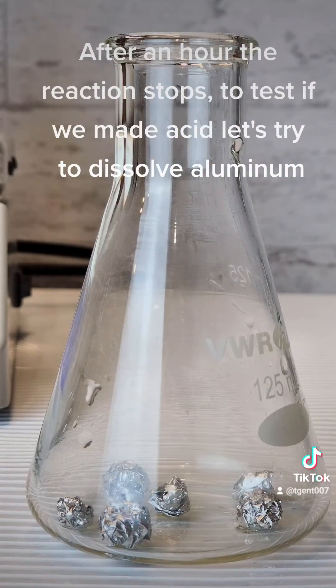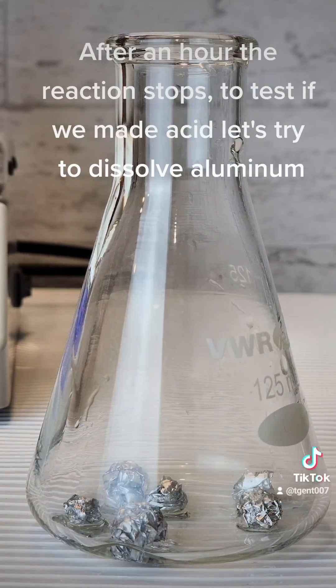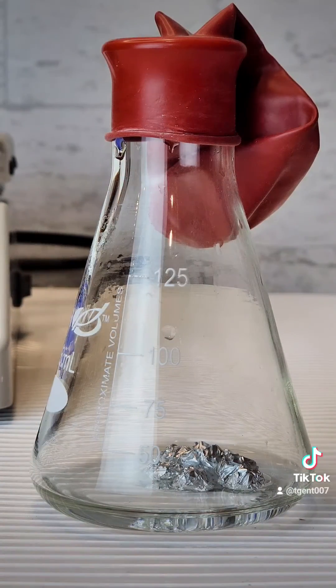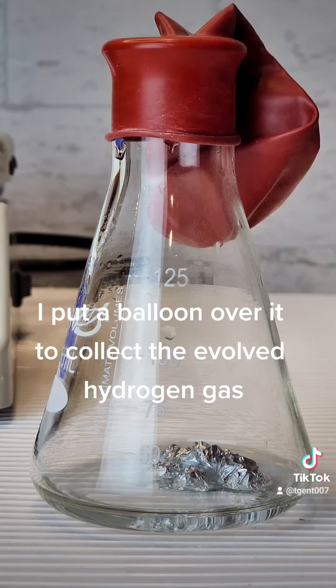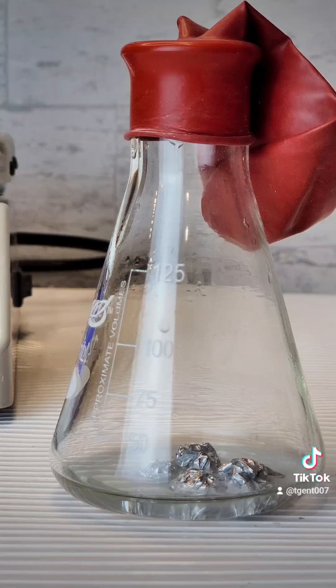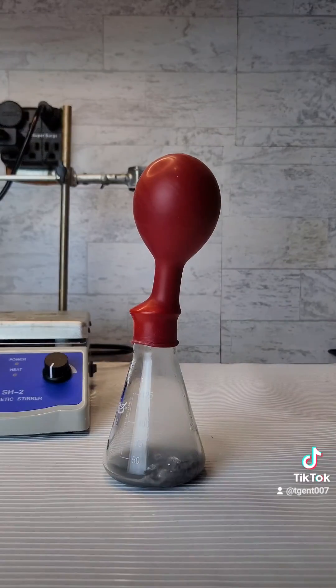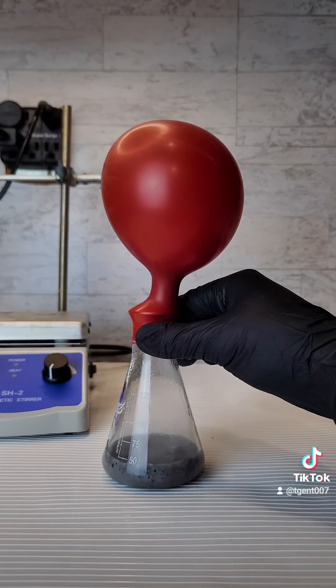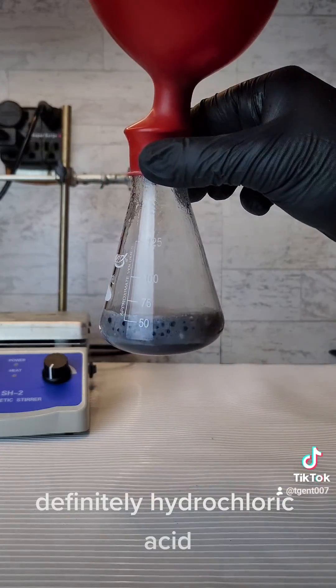After an hour, the reaction stops. To test if we made acid, let's try to dissolve aluminum. I put a balloon over it to collect the evolved hydrogen gas. Definitely hydrochloric acid.